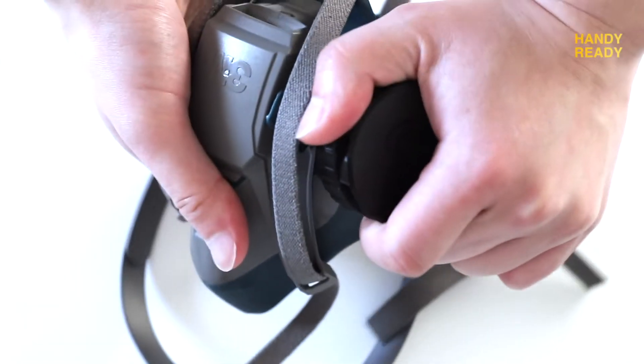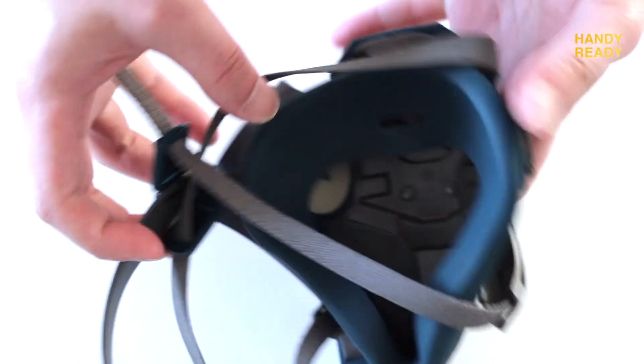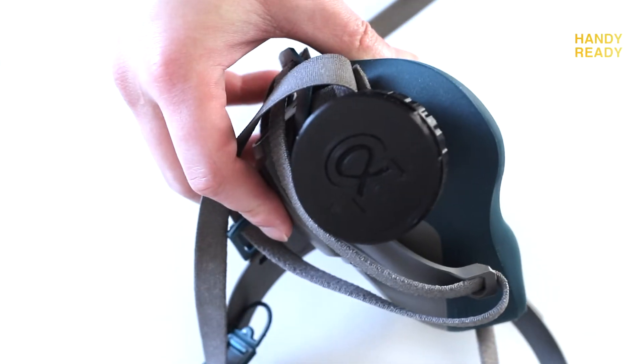And there you have it — it's just as simple as that. The hardest part is probably the 3D printing, which I'm going to cover in another video. But in terms of how it works, it's quite simple.